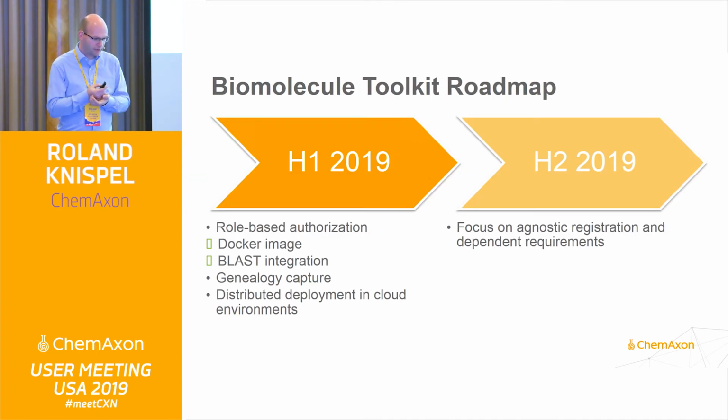A couple of things I have already highlighted, especially because the IDBS eWorkbook is a SaaS-delivered solution. We are at the moment making a couple of adjustments to be able to more easily deploy our toolkits in combination with their eWorkbook suite.